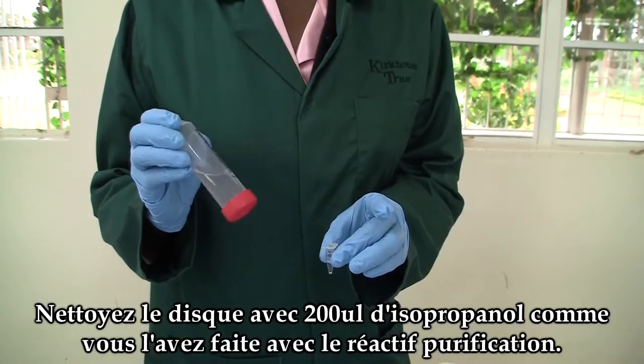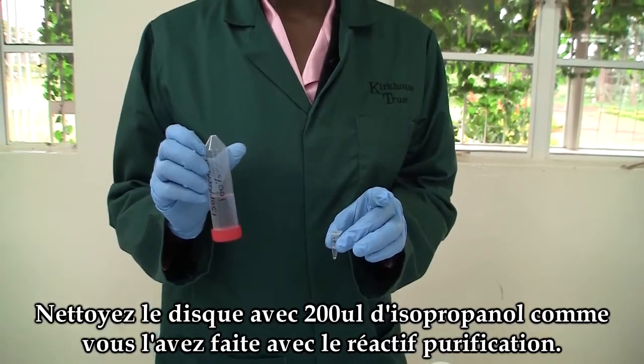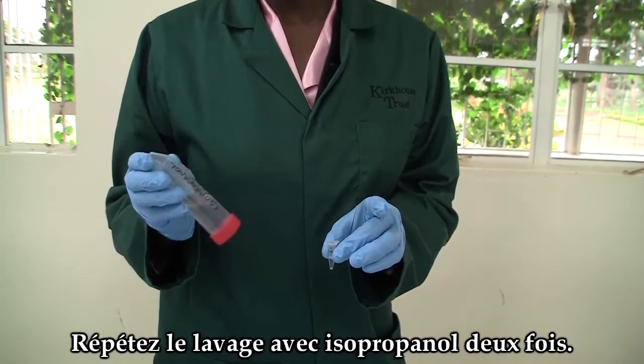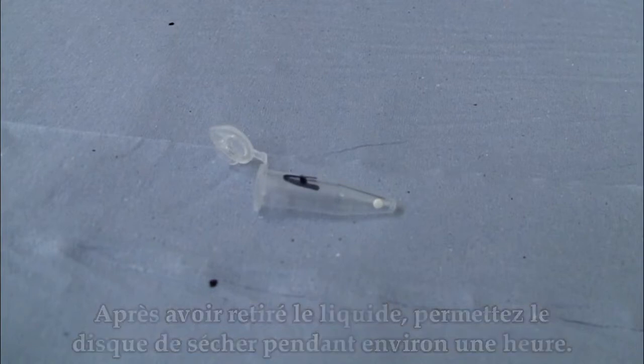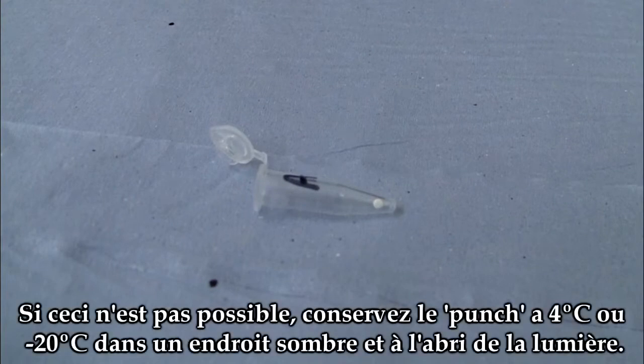Clean the disc with 200 microlitres of isopropanol, the same way you did with the purification reagent. Repeat the wash with isopropanol to make two washes. In some crops, TE buffer is used instead of isopropanol. Ensure that all the liquid has been removed from the FTA disc before performing analysis. Analysis should be done within three hours of disc washing. If this is not possible, store the punch at 4 degrees centigrade or negative 20 degrees centigrade in a dark environment.